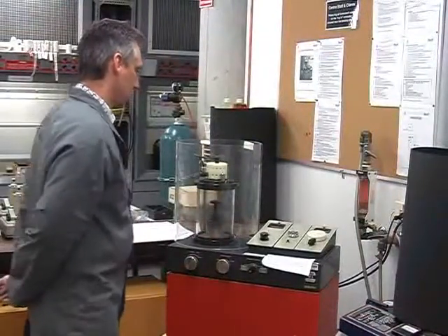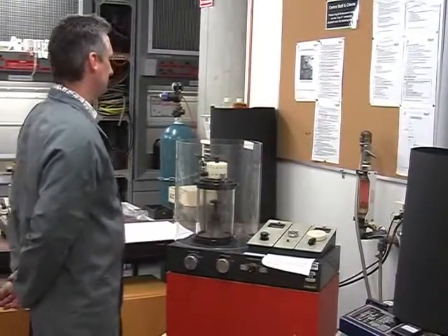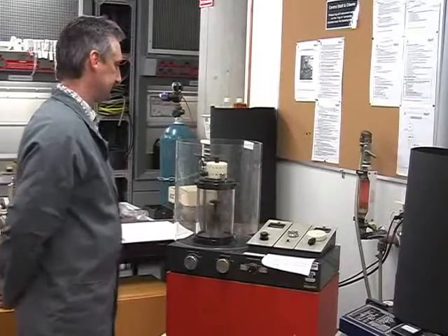Wait until the vacuum on the vacuum gauge reads less than 0.2 torr. This may take a few minutes, depending on the nature of the sample that you intend to coat.